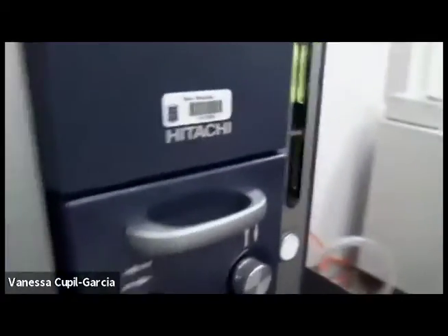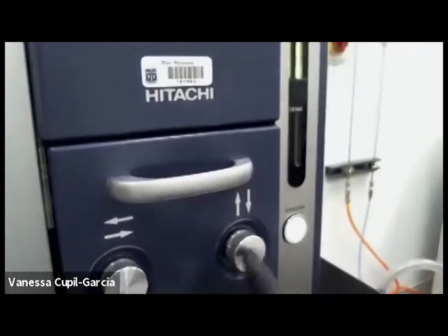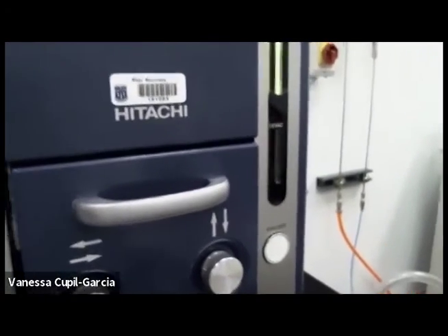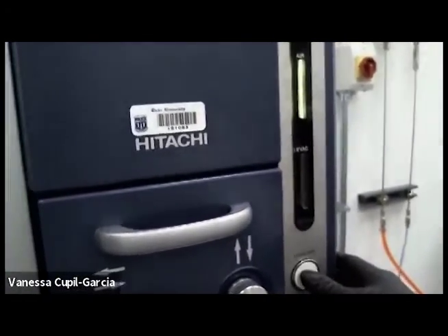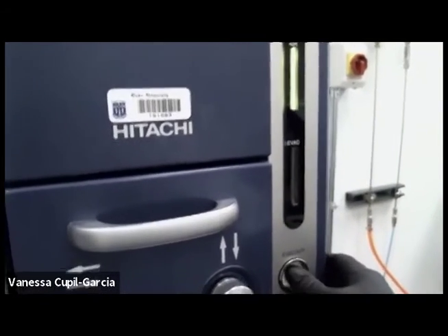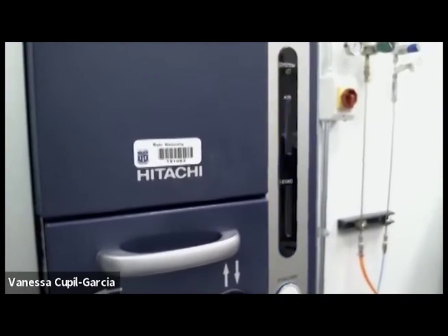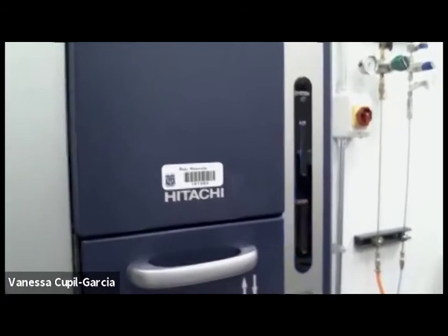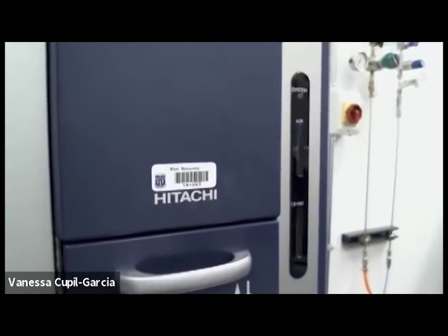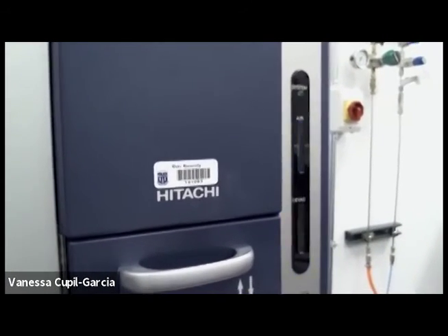So to get the microscope working, we close our chamber. And we can move our sample in different directions using these knobs. And turn on the vacuum.